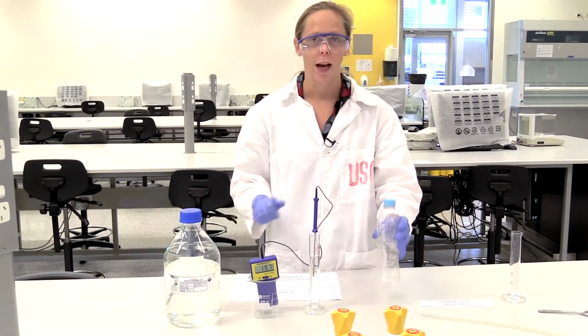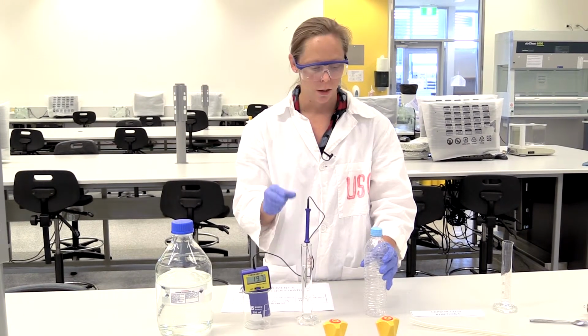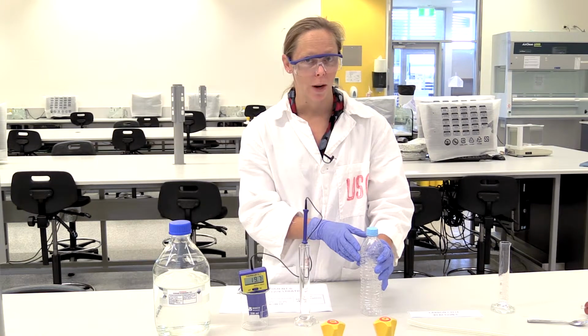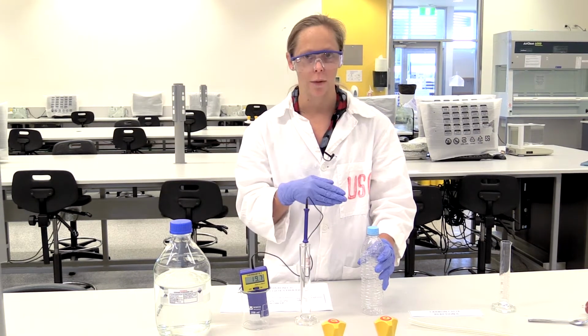Okay, so I've got my carbon dioxide in here and I've got my sodium hydroxide in there. So I want to see if I end up with sodium carbonate and water, and I want to see what the temperature change is. So we'll measure the temperature after we've done the reaction.